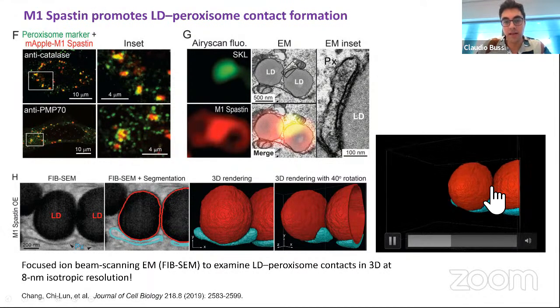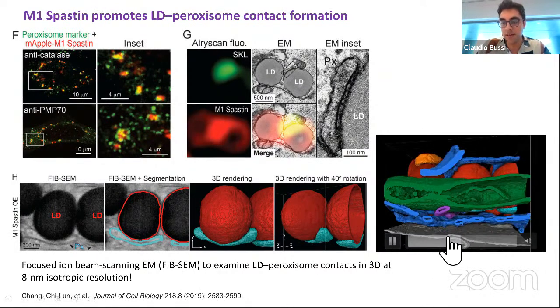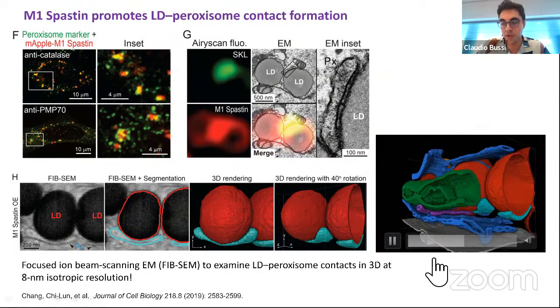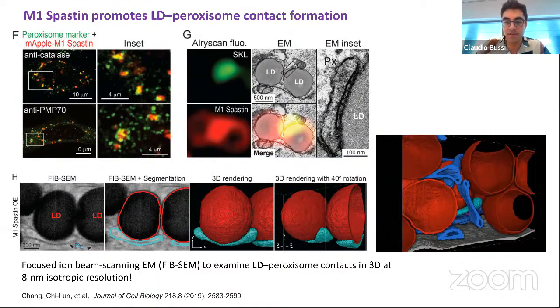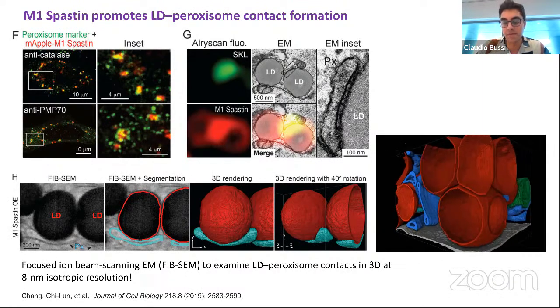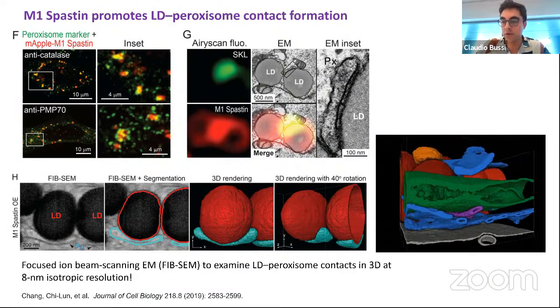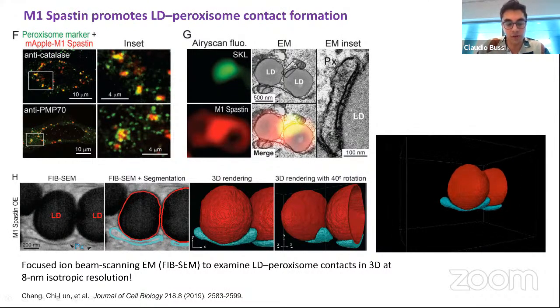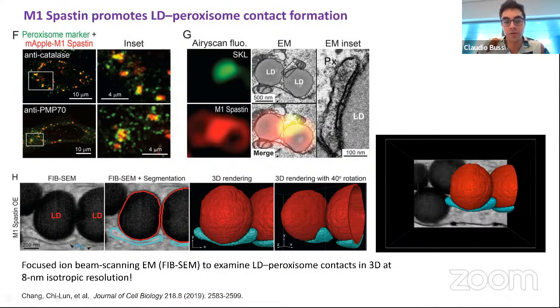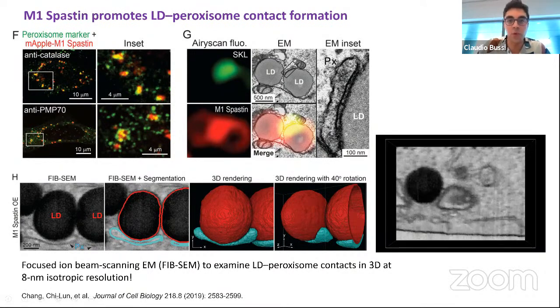Entonces acá en rojo tenemos a los lipid droplets, y en este turquesa cian se encuentran los peroxisomas, facilitando el sitio de contacto organela-organela. Y luego en otros colores ellos hicieron la reconstrucción del resto de las organelas en esa superficie, en todo el volumen. Fíjense aquí la resolución que ellos alcanzan es de 8 nanómetros en X, en Y y en Z. O sea, es muy, muy bueno.